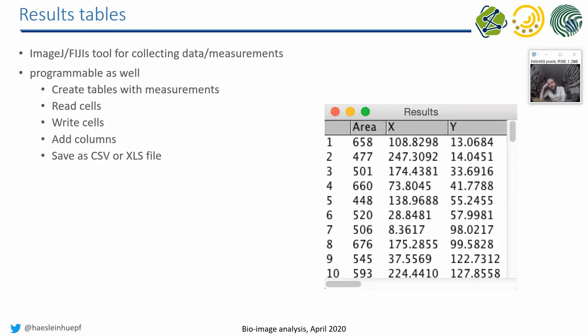And that brings us to tables. You have seen tables actually already a lot in ImageJ. Whenever you do a measurement, it results in such a window with numbers. And you can read, write, and I will show you how to do this programmatically. And you can save it to the disk.